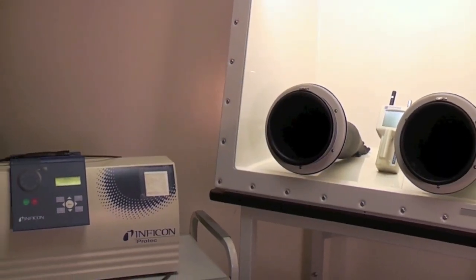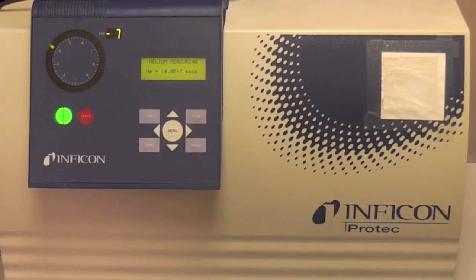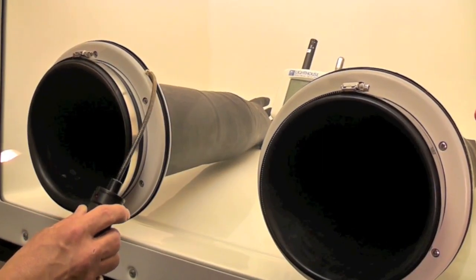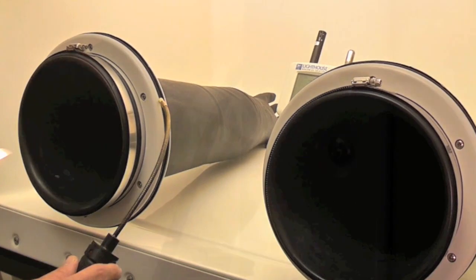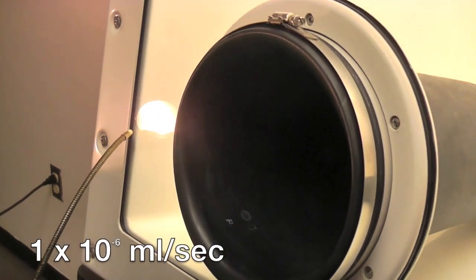Each glove box is leak-tested with a mass spectrometer while pressurized with helium at 1 inch of water gauge and shown to have no detectable leaks greater than 1 x 10⁻⁶ ml per second.